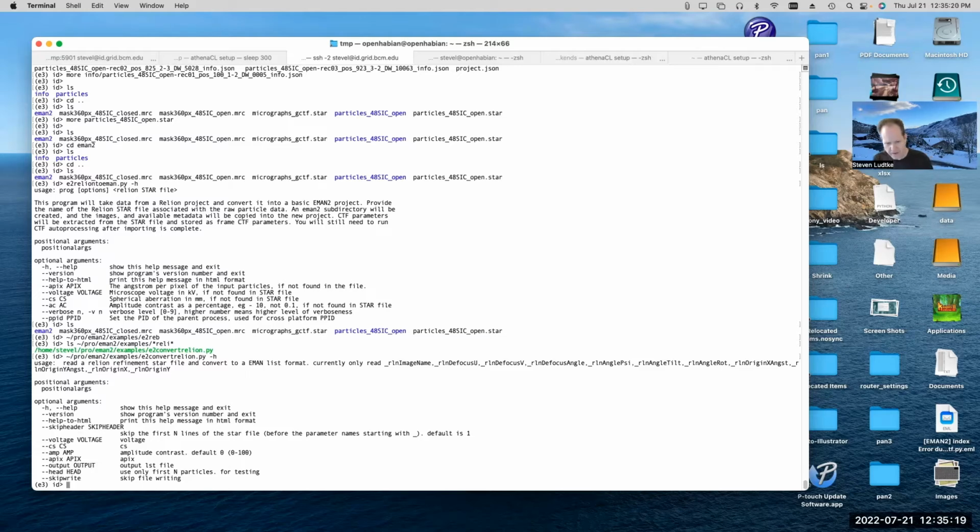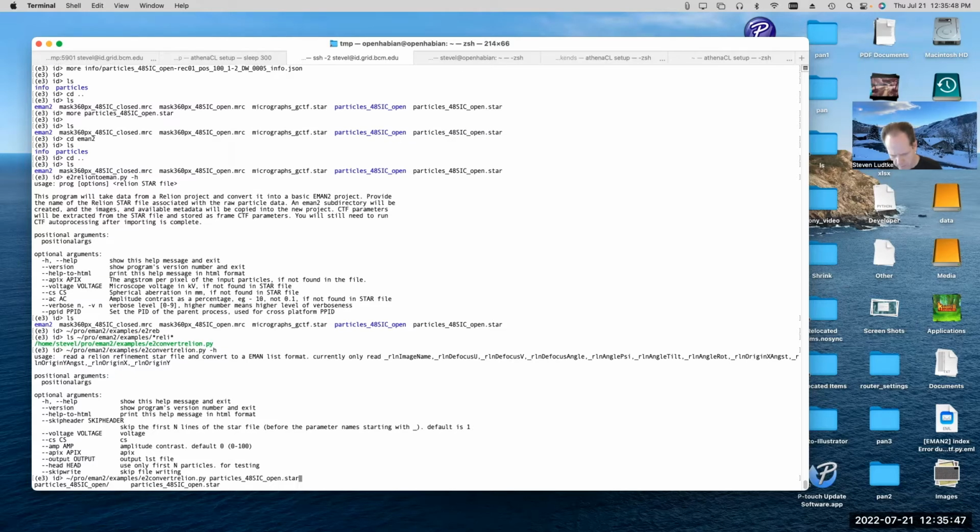Okay, this is very similar to the other program. It just generates one of these new format LST files instead of generating the old format JSON structure. So I'm going to go ahead and start that running now, because it's going to take a while to run, probably 20 minutes or something, because we're talking about 14,000 micrographs to deal with. So we just give it the name of the star file. And I don't think we have to give it anything else. I'll go ahead and say v1 for a little more verbosity, so we see what it's doing. And yeah, that's it.